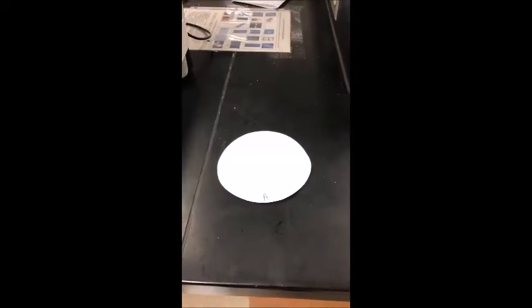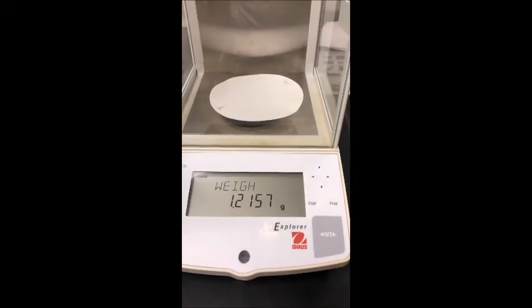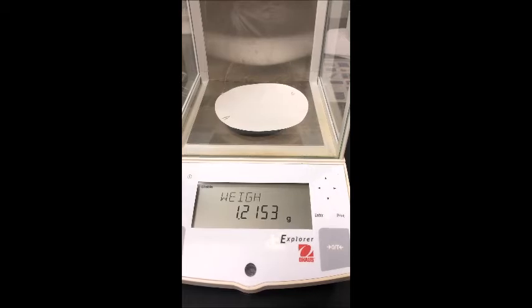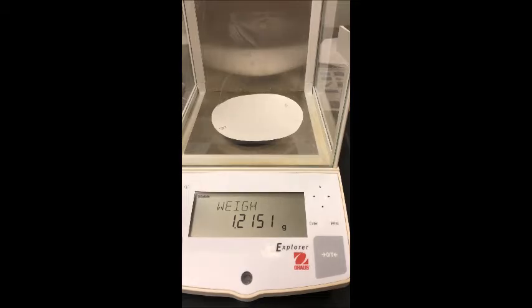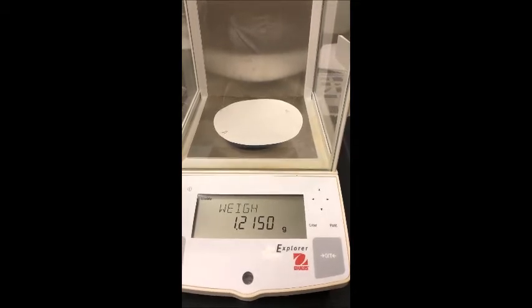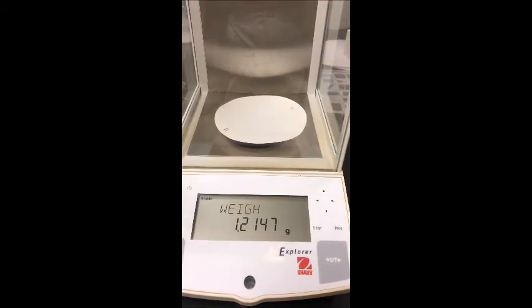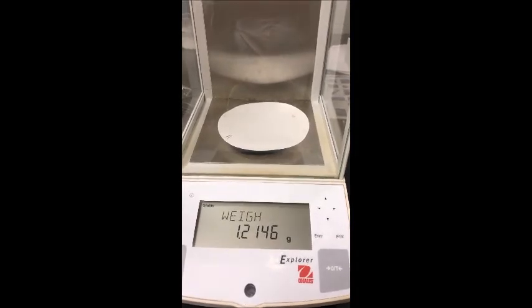Okay, before I can continue, I need to find the mass of my filter paper. So I'm going to label them A, B, and C for the different samples. So this is going to be the mass of the filter paper for A. So you can see here, I'm going to let that stabilize, and then we will write down 1.2153. And I'm going to do the same thing for the B and the C. That's adjusted a little bit, so let that stabilize and go with that. So I have all the filter paper data in my data table. All right, so stabilizing at 4.6.